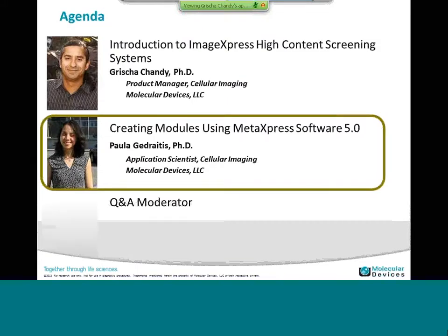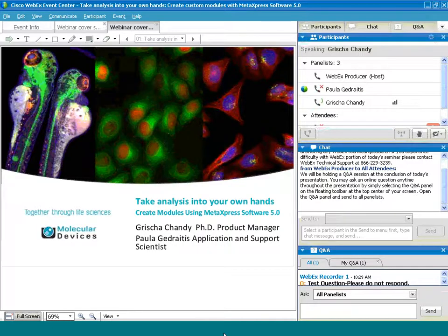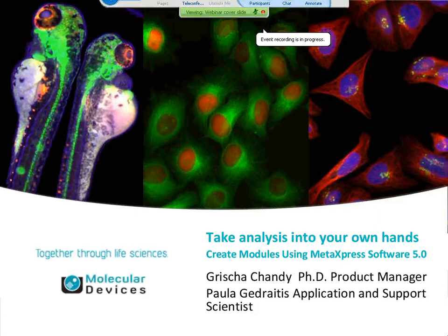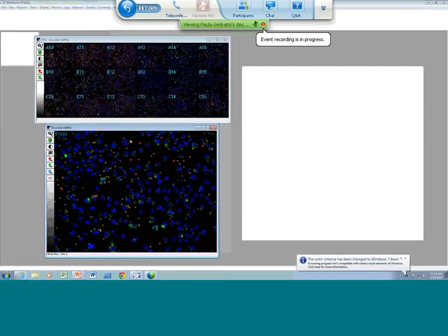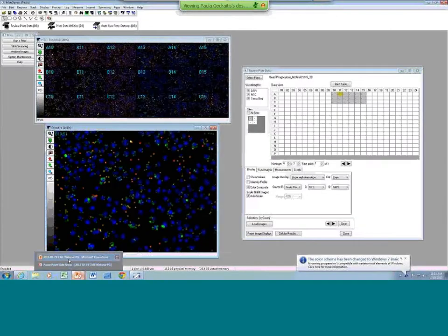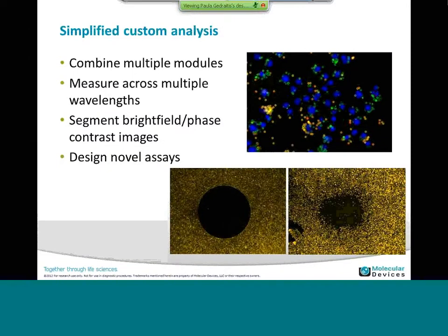On that note, I will pass the presentation over to Paula, who will go through some examples of using the new software tools. Paula? Hopefully everyone can see my screen now. So thank you, Grisha, for the introduction.